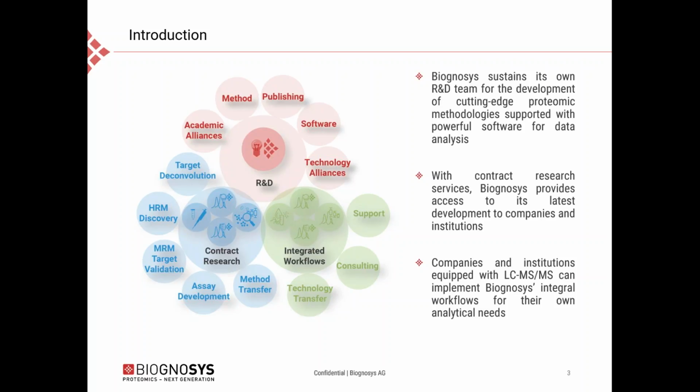What they did, as you can see today, is develop one of these tools, which we are now giving back to our product customers, but we are also using it in our contract research projects to show our customers how their data looks and to judge the data based on QC parameters.